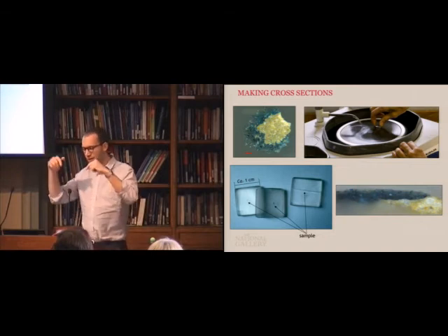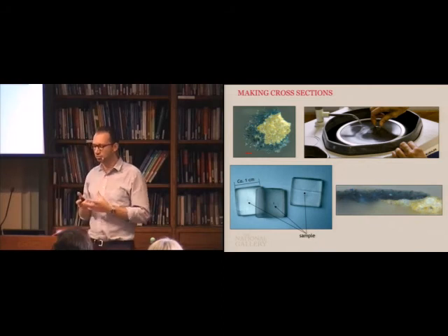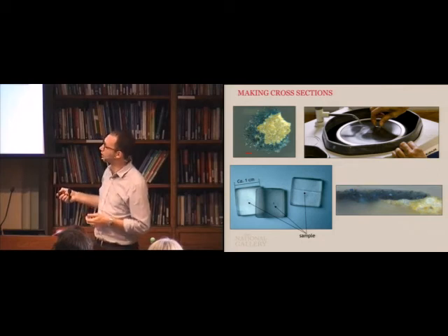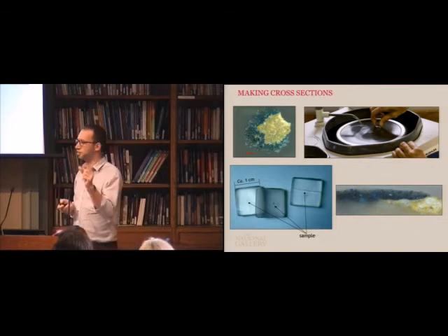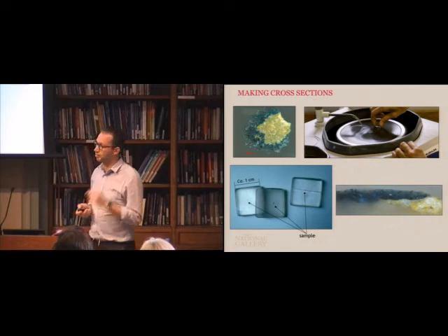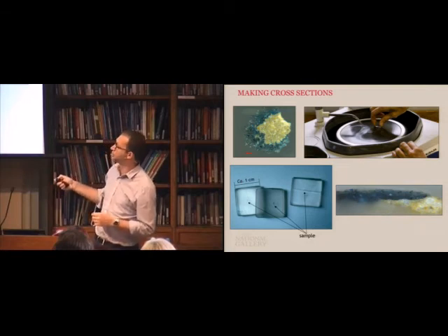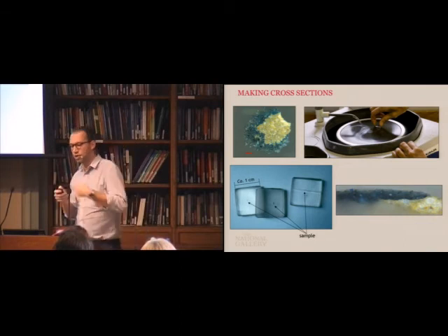So we've taken a sort of geological core type sample. We've then encased it in resin, which hardens. And you can see the resin blocks down here. And my sample is this little bit in here. So that's less than half a millimetre in length. So my samples are very, very small. These are then ground edge on so that you can get something like this. So you can see the yellow that was here in my unmounted fragment, and then a blue on the top. And that's beginning to tell me something about the artist's technique.